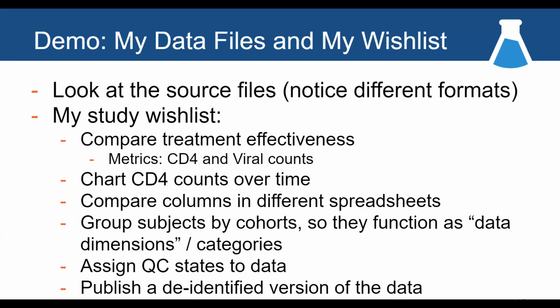There's a lab results file, and this is a blood count assay. It gives me the CD4 counts, CD4 white blood cell counts, the total lymphocyte counts, and a hemoglobin level.